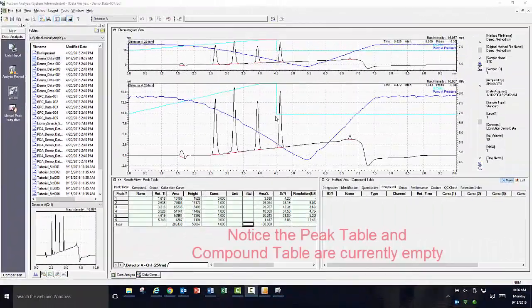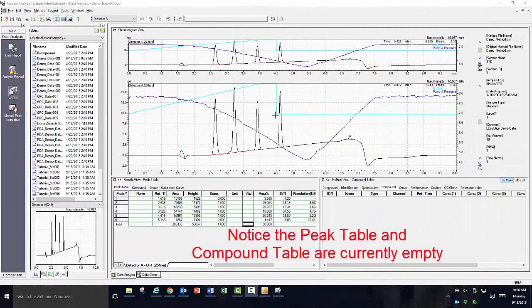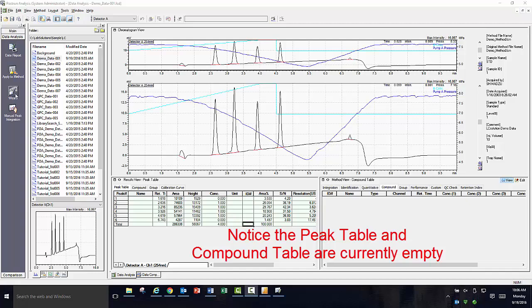Next, I would like to walk you through using the compound table wizard. The purpose of this wizard is to provide you a guided step-by-step process to identify your peaks of interest and get the necessary information entered to allow for a quantitative result once a calibration curve has been generated.